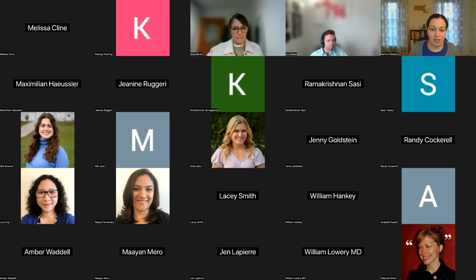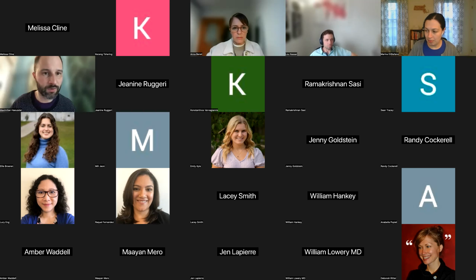Yeah, so then the other question, and this is kind of what Deb had mentioned, but we had someone else put this in the chat: any thought of integrating cancer hotspot data and a link to cancer hotspots? Yeah, I think we can look. I think Max mentioned, right, Max, that we can look at that. How is the format? So for the hotspots, I got a confirmation from Christine Maloney that every group has a different way of writing that in the spec. So that will be hard to import.